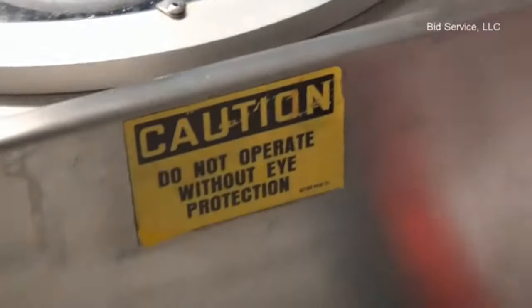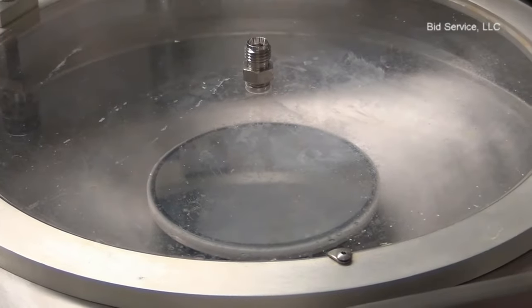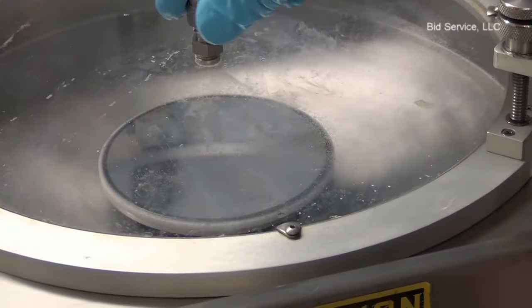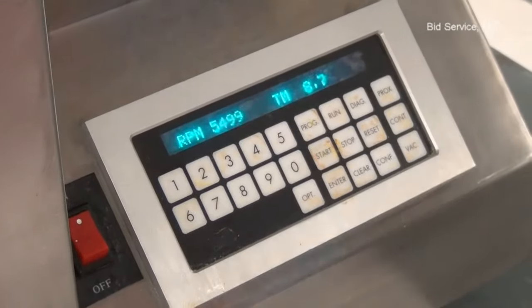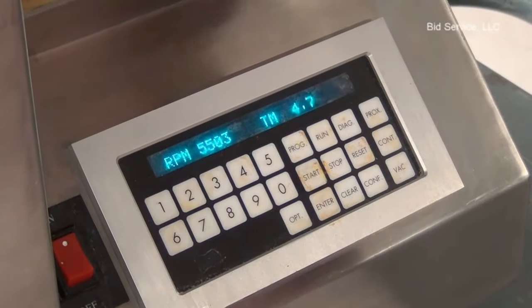There is a port here to dispense the photoresist. This unit does not include any dispense attachments — it is only a spin coater. The photoresist is to be dispensed manually.